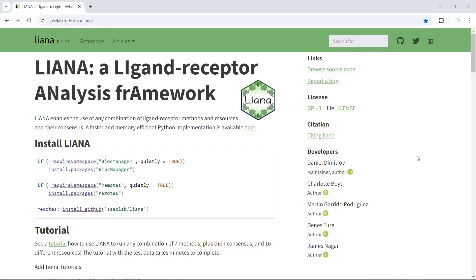Hello everyone, welcome to my video tutorial for single cell RNA sequencing data analysis. Today I'm going to show you how to use the LIANA package — a ligand receptor analysis framework. This package was developed by a Germany group. If you use this package for your data analysis, you should acknowledge the original authors.